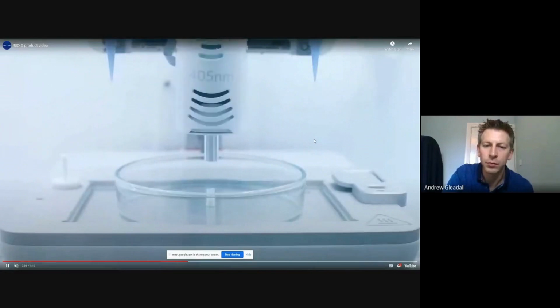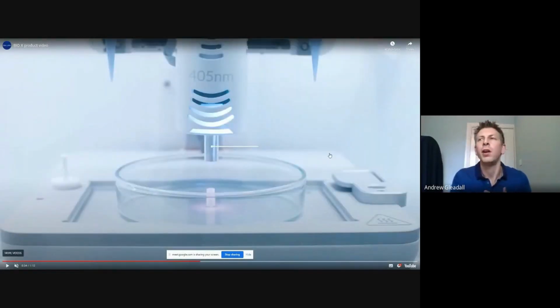And this is showing the UV curing. UV curing is very common for bioprinting because the gels that you'll use will often not be very viscous, so they're very runny. They want to be runny for several reasons, but particularly to get the material to flow through this long, thin nozzle without having a high shear rate, because high shear forces can kill the cells.